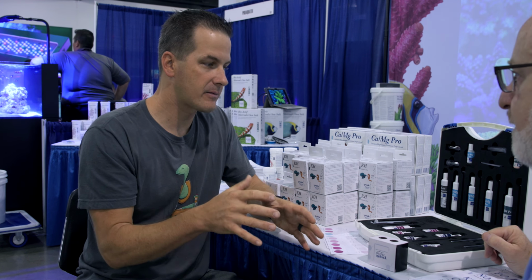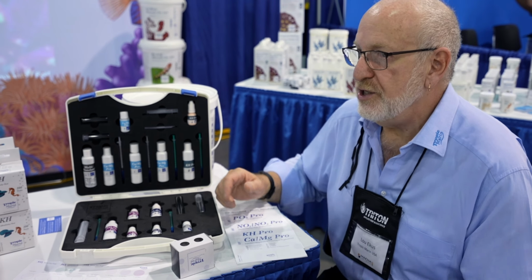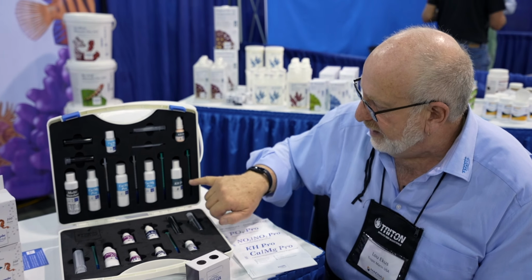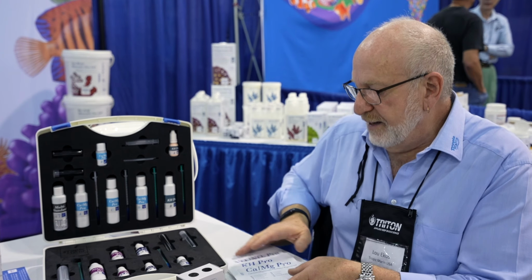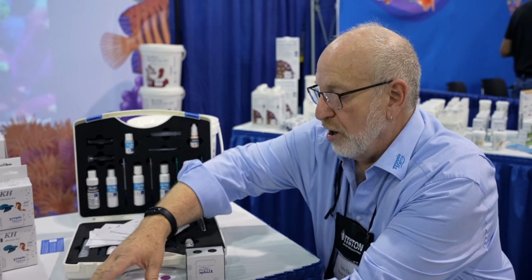If I'm running a test, say for KH, for alkalinity, and I'm using that one and accidentally use that syringe for calcium, is that going to throw off the result? You can. You don't want to mix up the syringes. If that happens, you need to clean out that syringe 100% before you then match it to the reagent that you're going to use. But that's why I like this, because each syringe is matched to the reagent that you're going to use it with. So as long as you put it back where you found it, then you know it's associated with the right thing. And then you've got all your instructions, you've got all your color cards, right?